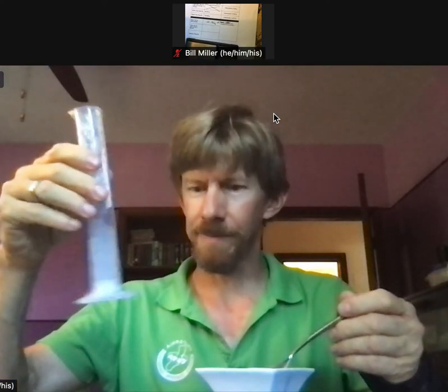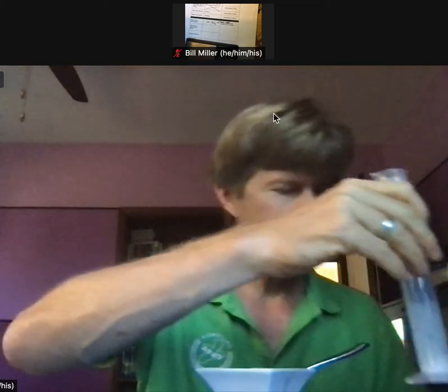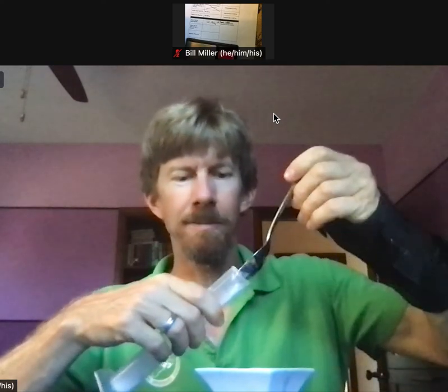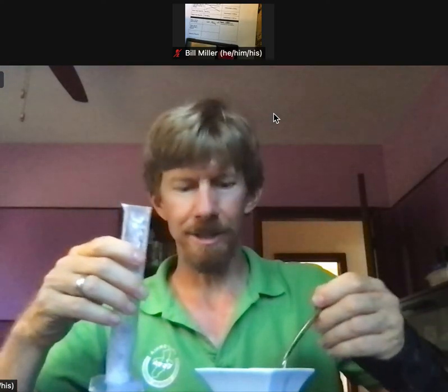Anyway, I think it's going to dissolve a little easier if you put the water in first. We'll see. Let's see how much I've got down there so far. So we're going for 10 grams, so we need 51.96. And we're at 44, so we still have a ways to go. So all we're doing is getting to 10 grams here.